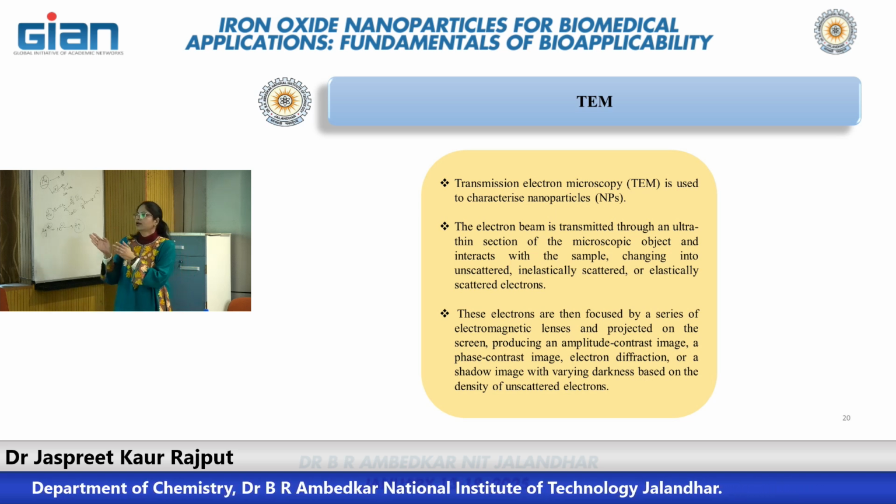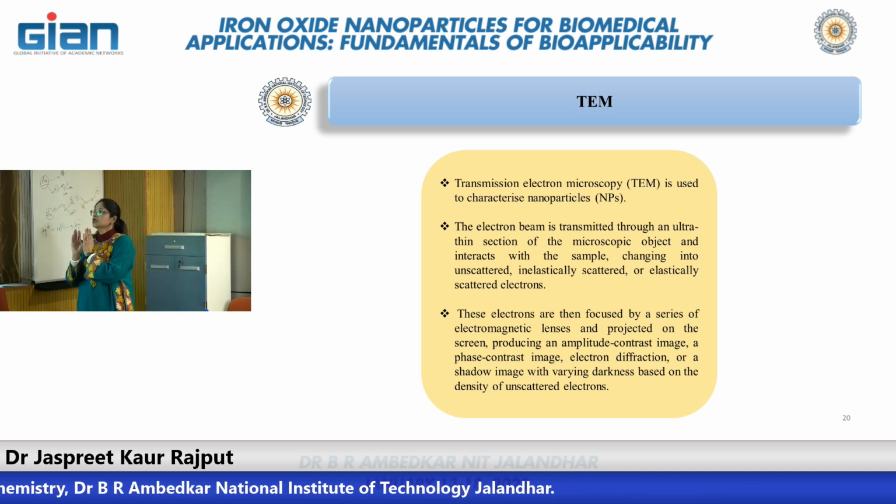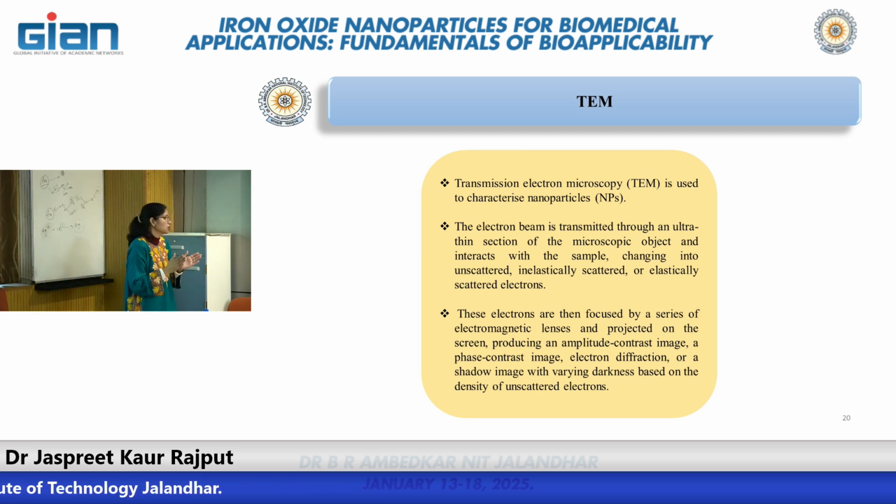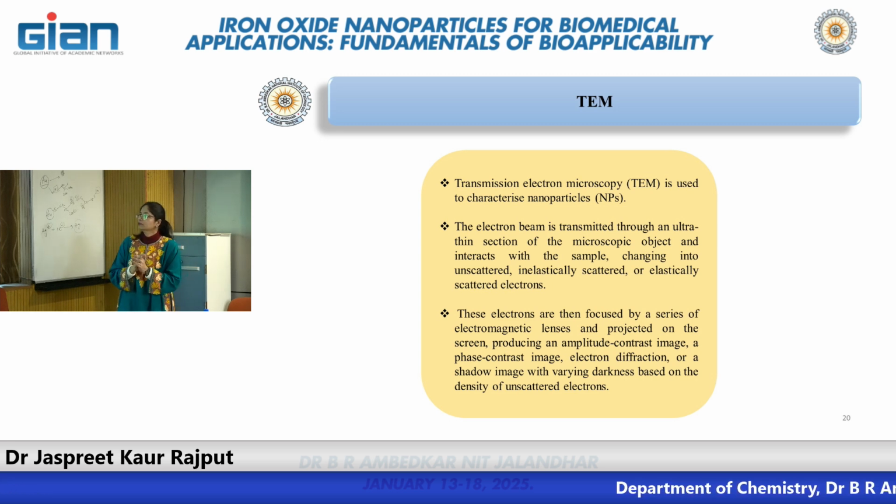Here, if you want to see the size, shape, morphology, and whether it has a layered structure or a coating, you can easily find out through transmission electron microscopy.